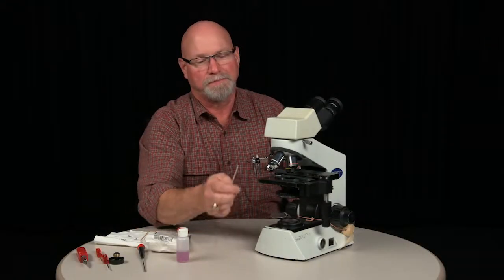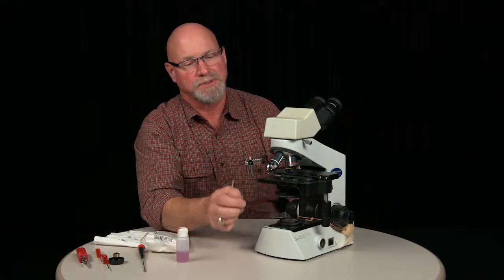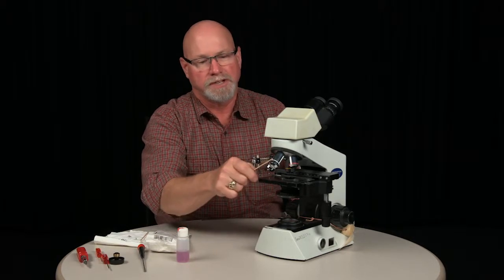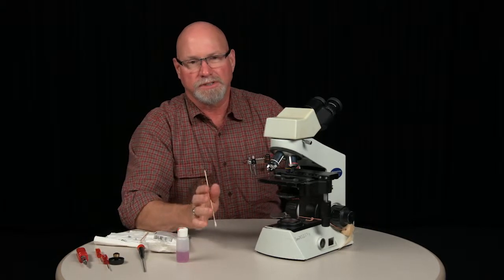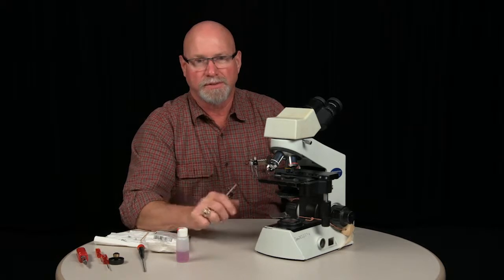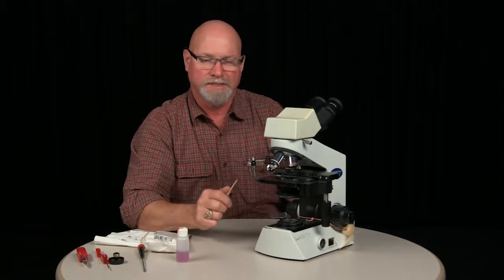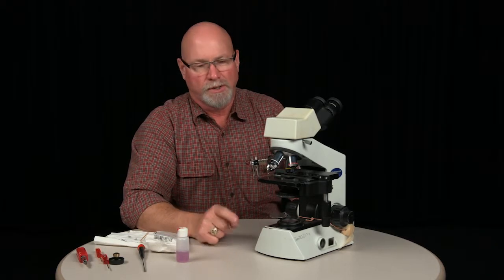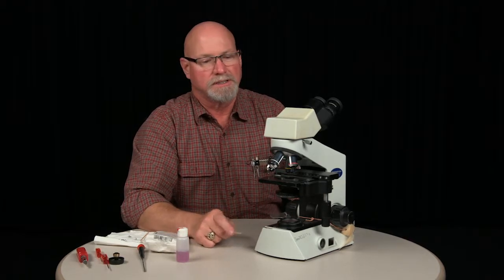At the end of the day, a couple final tips for you would be remove any excess oil from the oil immersion objective. And always use clean immersion oil. Never mix new with old existing oil. You'll contaminate your new oil. Always use clean lens cleaner.